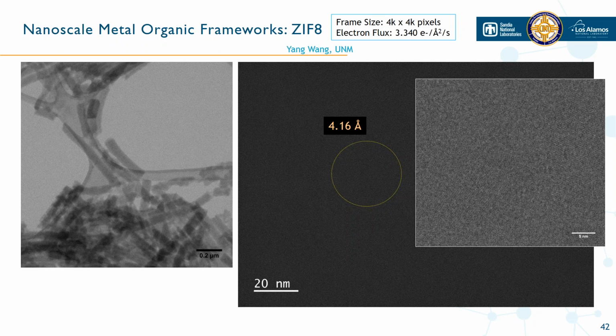And being able to see this and check out the information while I was acquiring, I was making sure that I got the data. And for cryo, you only have so many minutes of stability, especially at very high resolution imaging. And so I think that this, using the camera, saved a lot of time in acquiring this data for the user. So next slide.